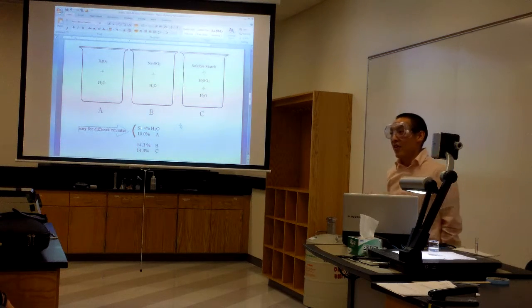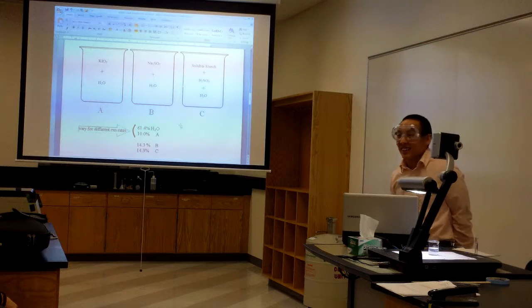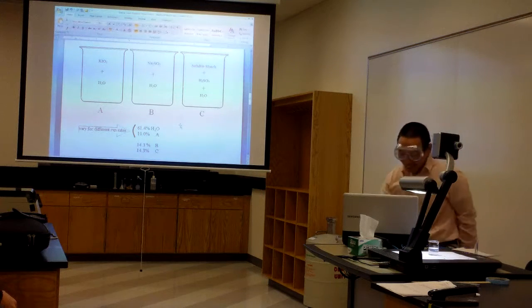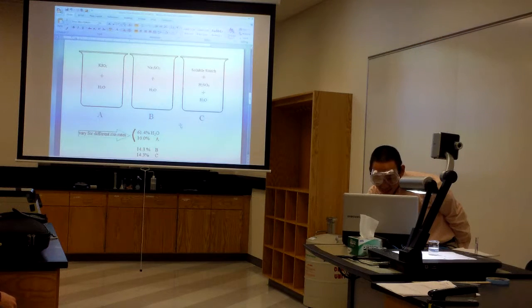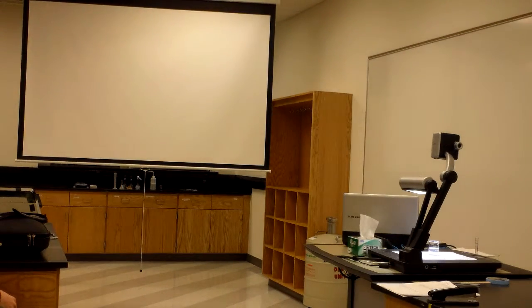Any guesses? An exothermic reaction. Okay, that's one guess. Any other ideas? I'm not saying you're wrong or right. Make a clock? What do you mean by that? It's called the iodine clock reaction, so something has to tie in there. Is it going to happen in 60 seconds? Or it's like a clock? It'll tick. Perhaps? Okay. Well, those are some ideas. I'm going to move over to this guy. That'd be the coolest thing ever.